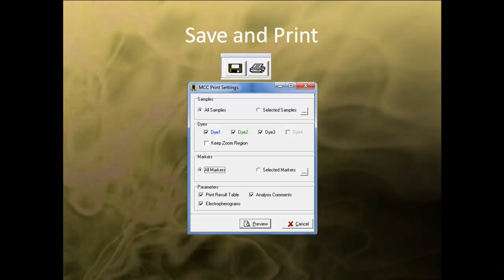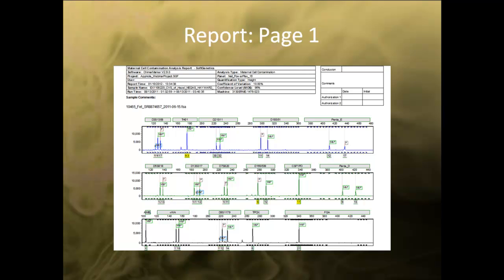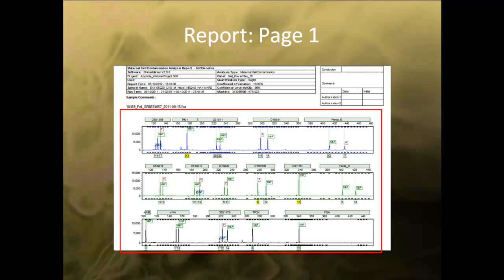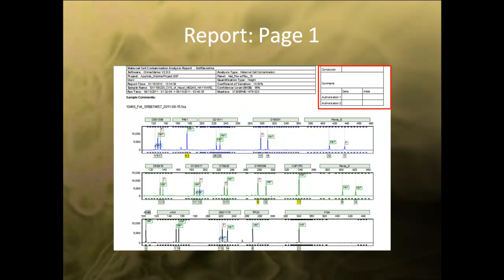Click Preview to see the layout of the report. The first page of the report contains a header, which lists all the analysis parameters used for analysis, user management information, and sample information. The electropherograms display the markers and allele calls with appropriate identifiers. The signature sign-off box is on the upper right-hand side.